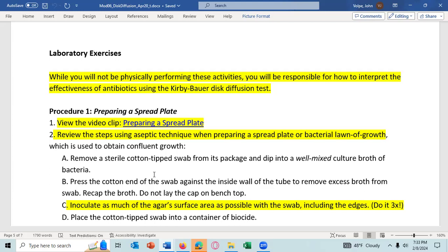You then take the cotton swab and your disc, you take off the lid to the disc, and then you take the cotton swab and you swab everywhere on the agar plate, covering the surface of the agar with the bacteria that's in the liquid of the media.